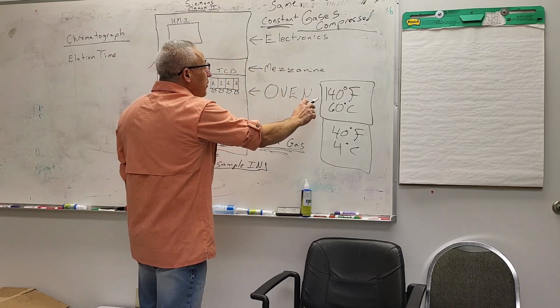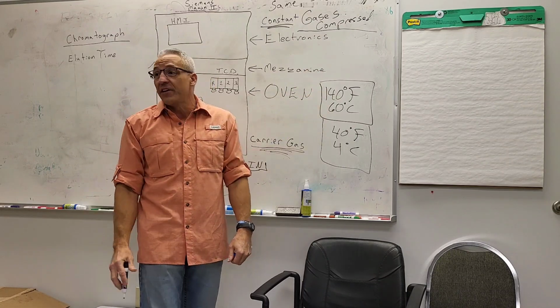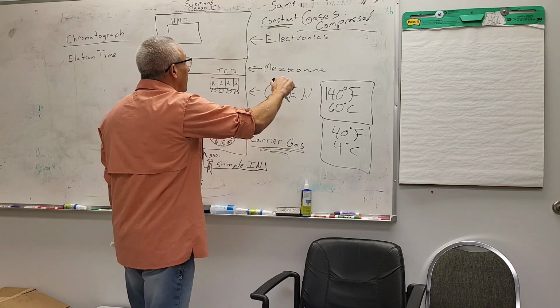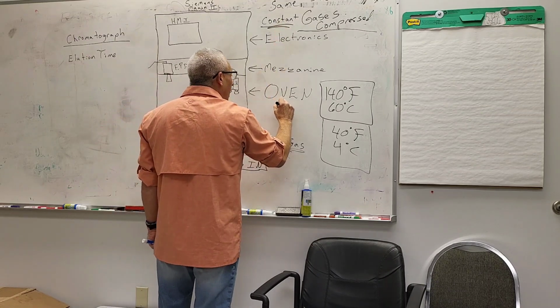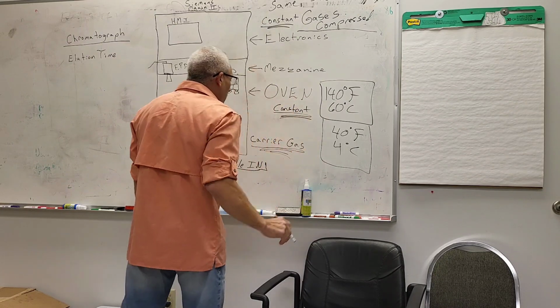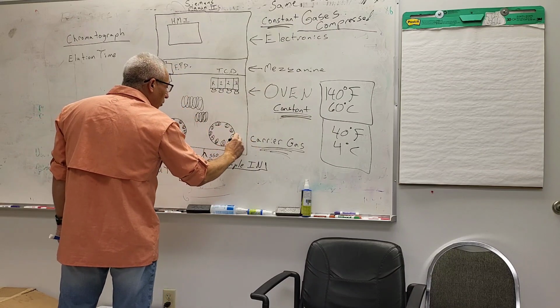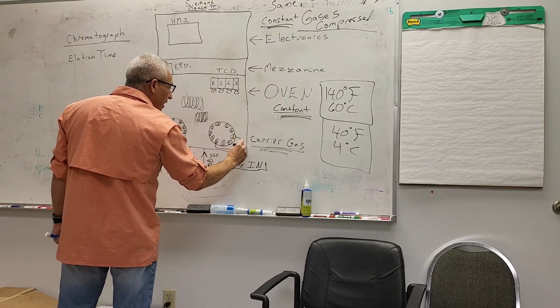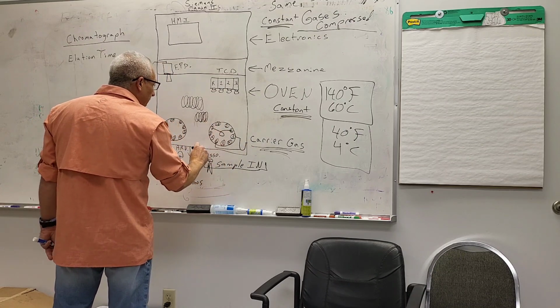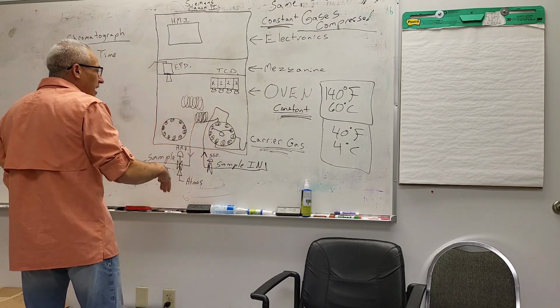So an oven is going to remain at a constant temperature. And when I say constant, these oven temperatures are within 1 degree. They maintain a constant temperature. Another constant. GCs work off constant. We're going to have carrier gas coming in. Carrier gas in this case is going to come in on 3 and 6, and sample loop 2 to 9, sample in 1, out 10, same thing over to here.